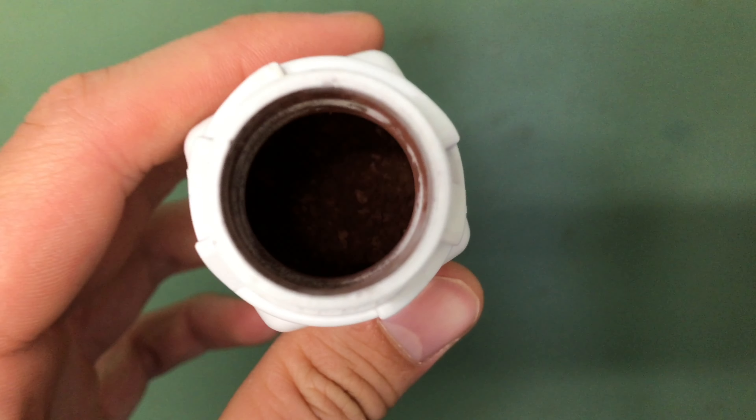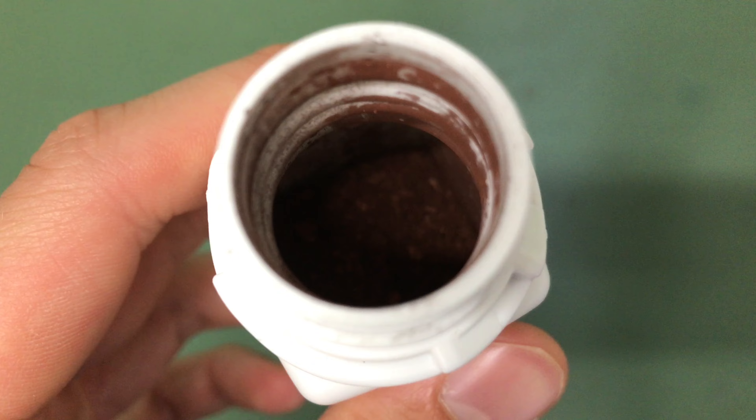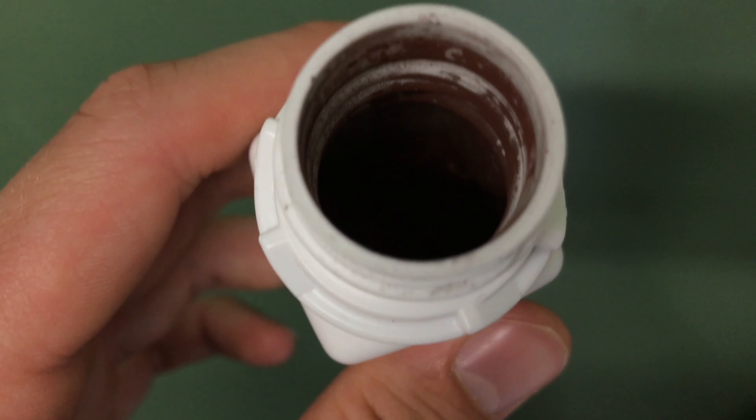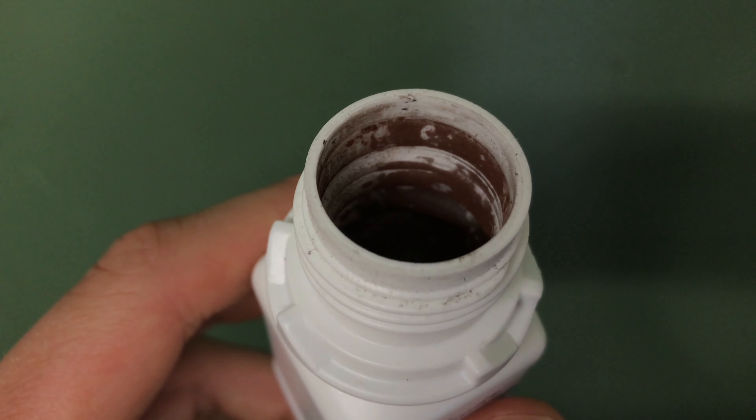If you only want some copper powder, you can leave the mercury salt away and simply add the hydrochloric acid. The yield is good enough, but I wanted to try this little experiment with the mercury salt. Have a nice day and until next time.